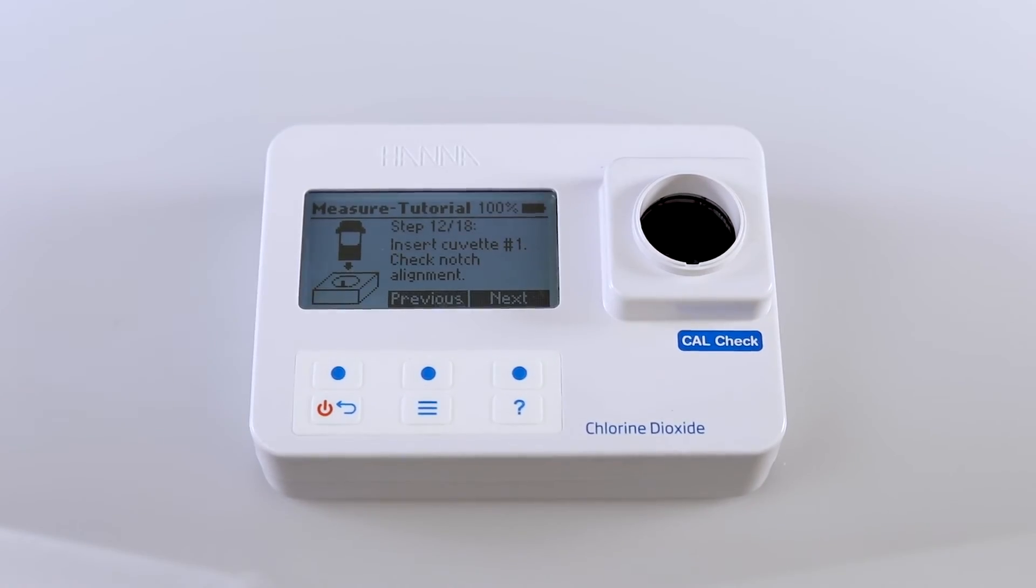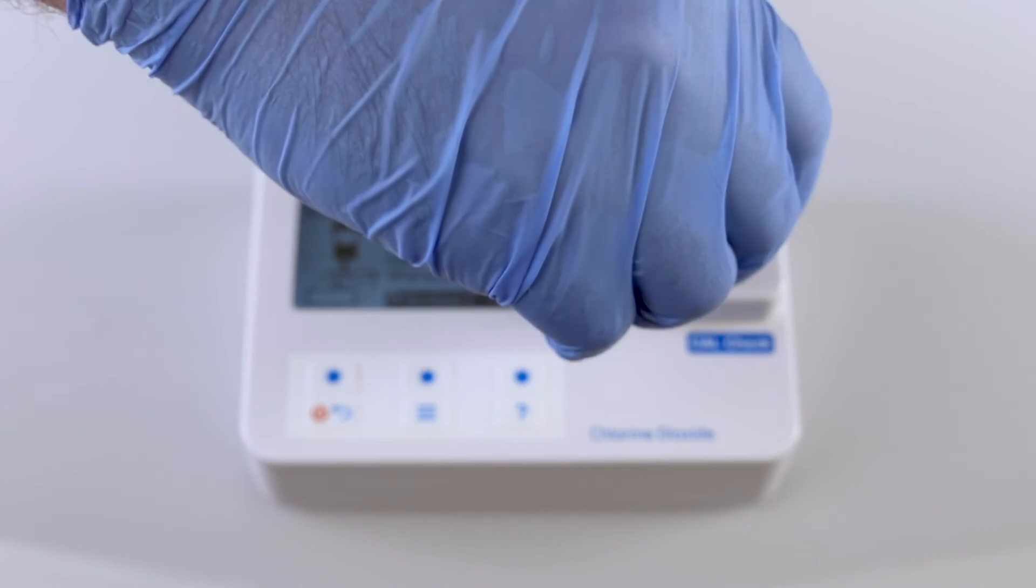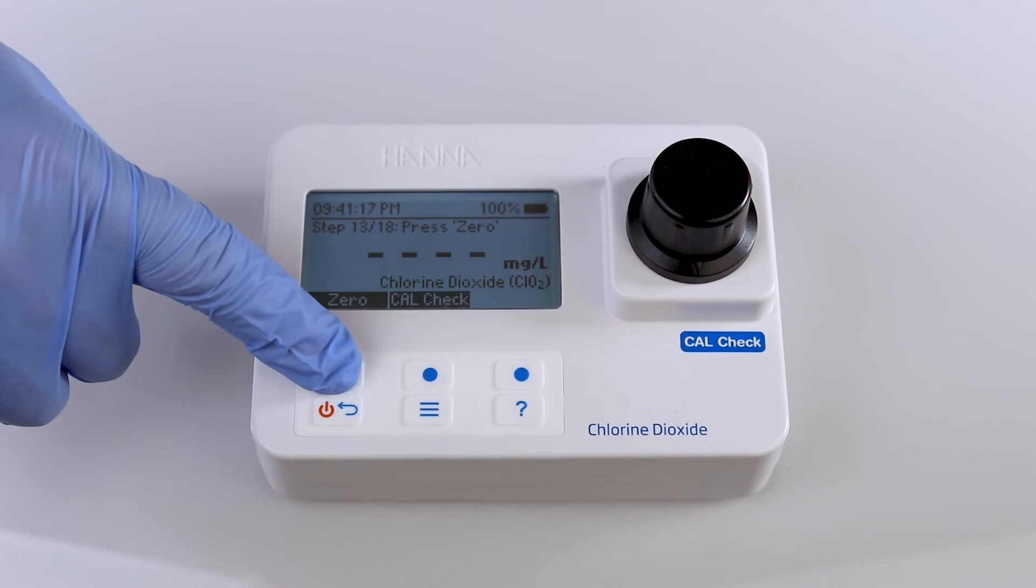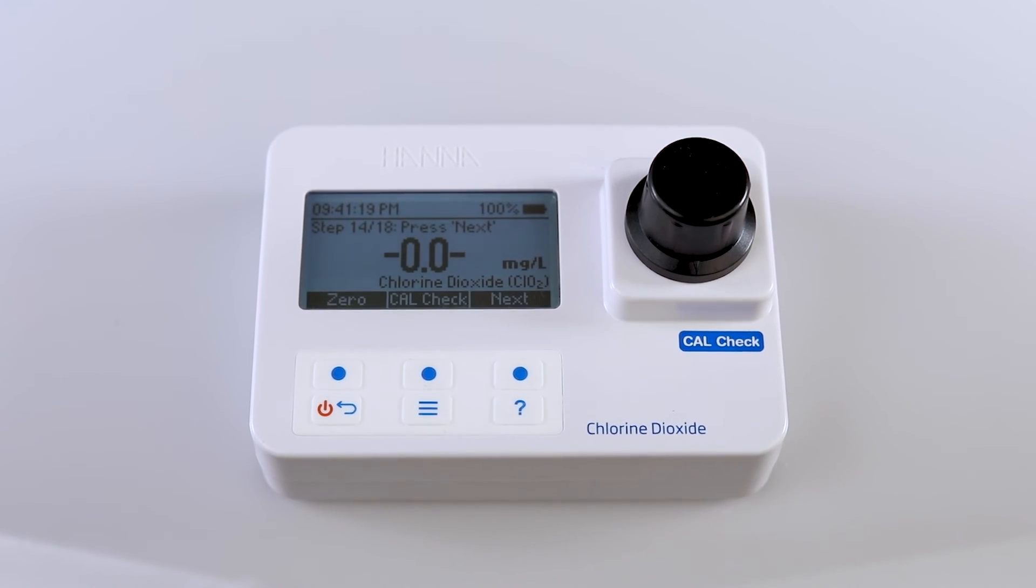Once finished, insert cuvette number one containing your blank sample into the holder on your photometer, ensuring that the notch on the cap is positioned securely in the groove. Press 0. The display will show 0.0 when the meter is zeroed and ready for measurement.